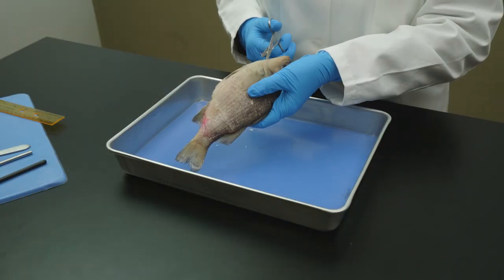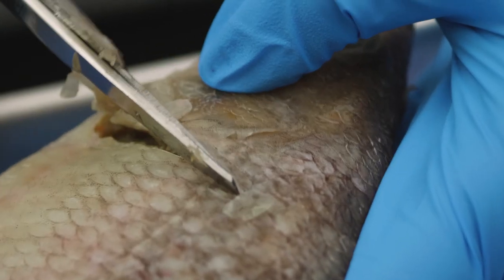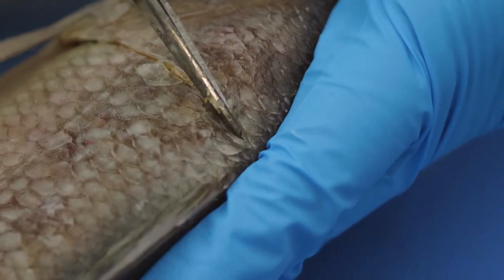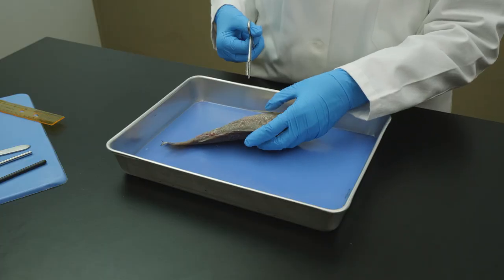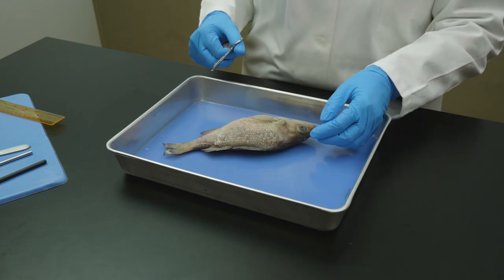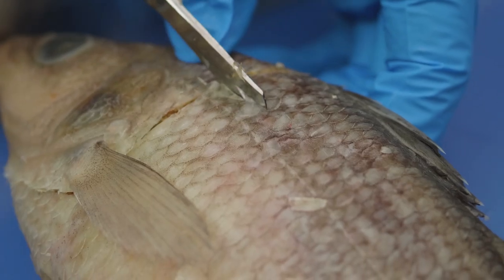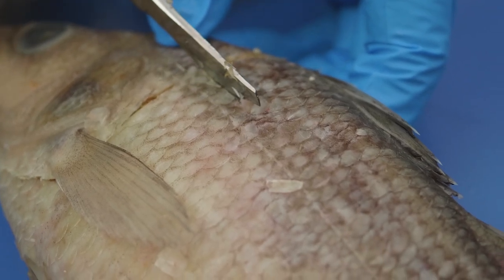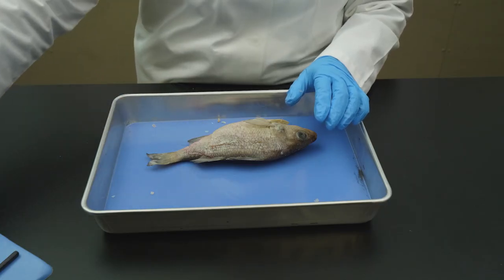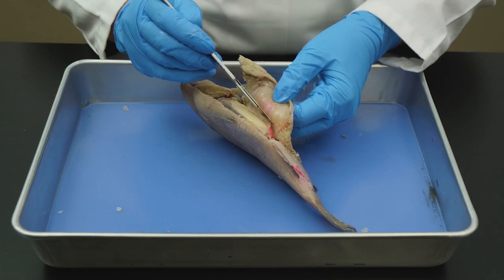Next, we make another transverse incision, this time from under the operculum up to the anterior dorsal fin. We do not want to damage the gills when we make this cut, so we cut around the operculum, just posterior to the pectoral fin. Next, we make another lateral incision, this time just above the lateral line, back to the transverse incision we made earlier.